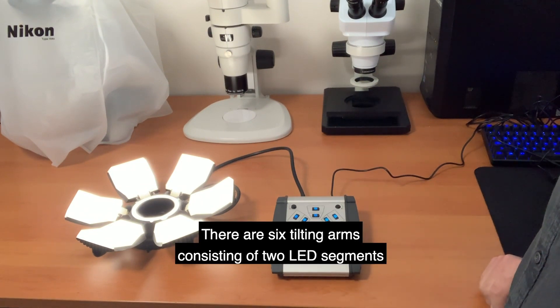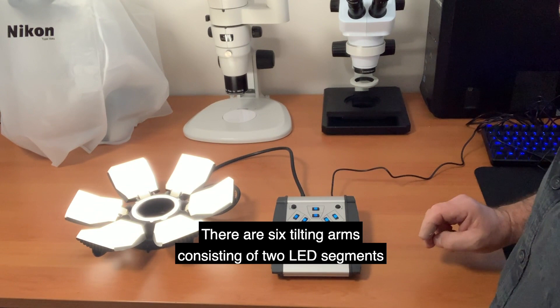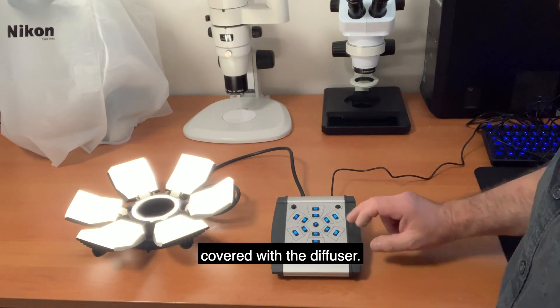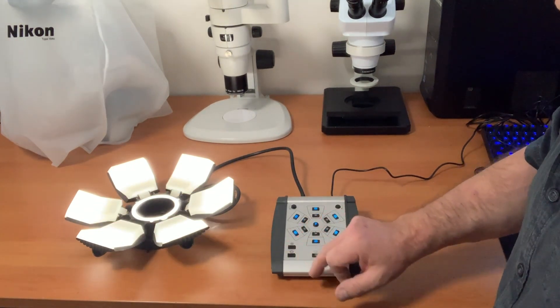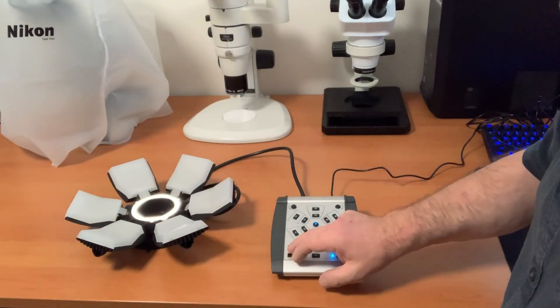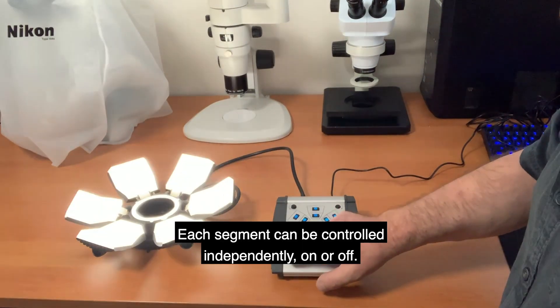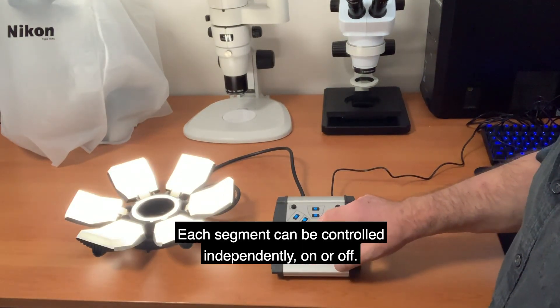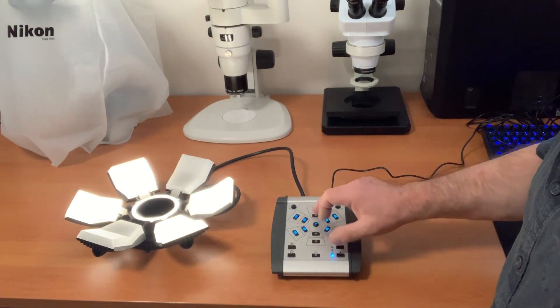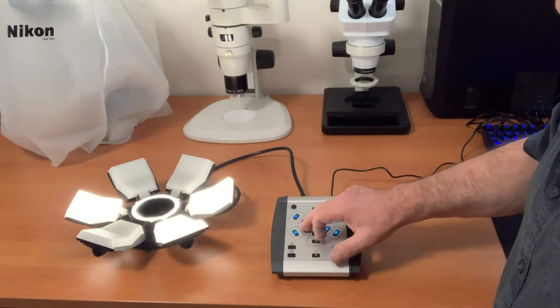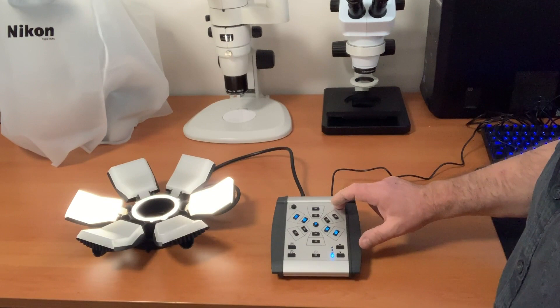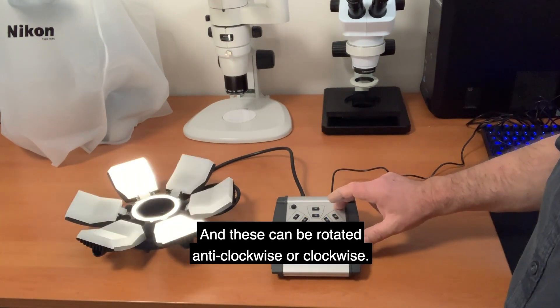There are six tilting arms consisting of two LED segments covered with a diffuser. Each segment can be controlled independently on or off. These can be rotated anti-clockwise or clockwise.